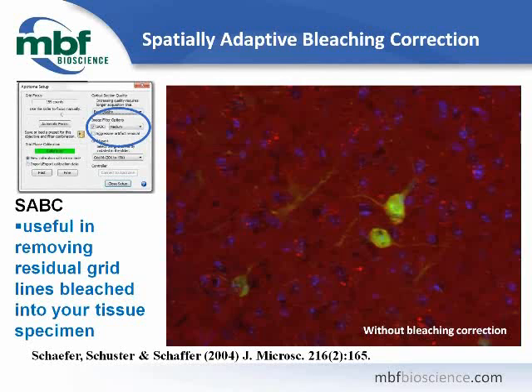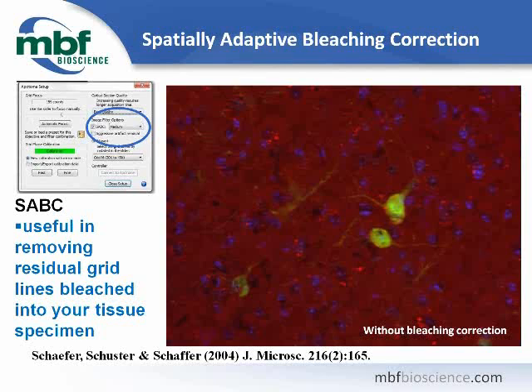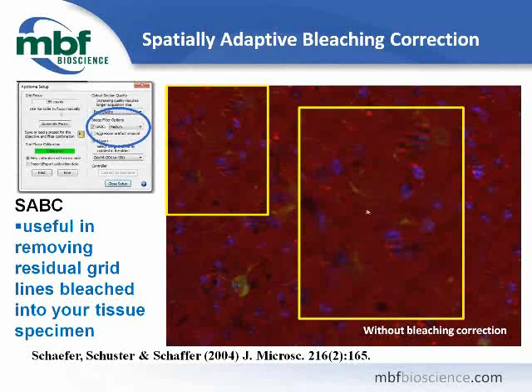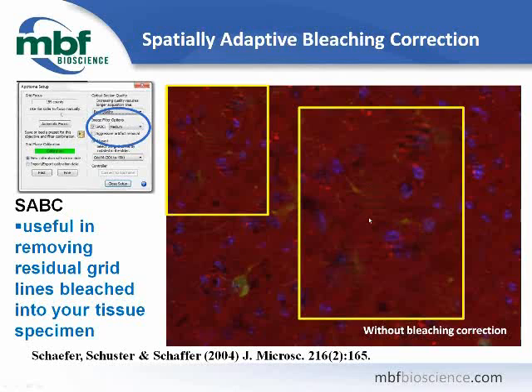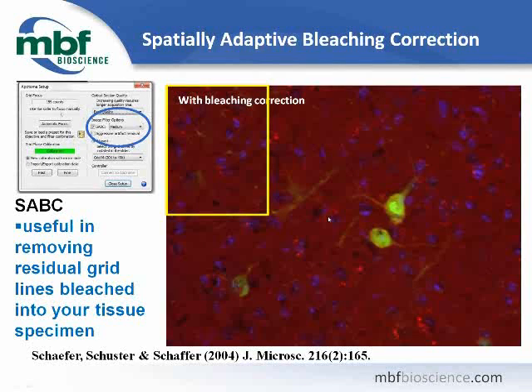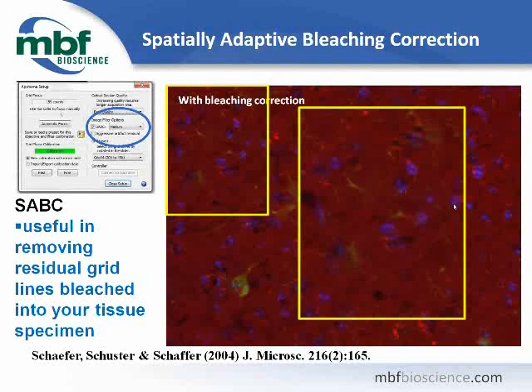I'd also like to mention the spatially adaptive bleaching correction (SABC) filter. This is particularly useful when you've been imaging a region for quite some time and grid lines have started to bleach into the tissue sample — you'll start getting residual grid lines in your final optical sections. Turn on the SABC filter, in this case we selected medium (there is also weak and strong). Recapture the image and you'll see a much smoother final optical section with no residual grid lines.